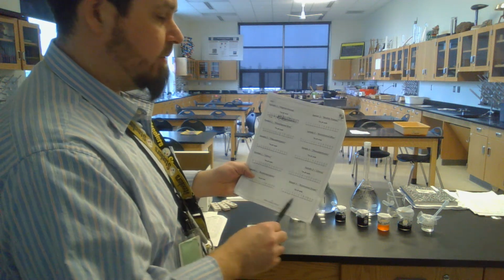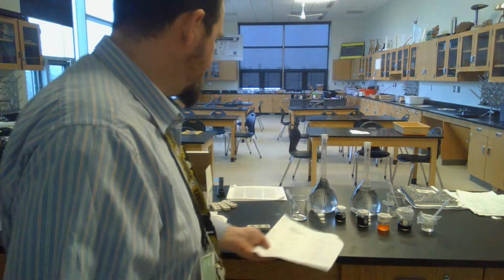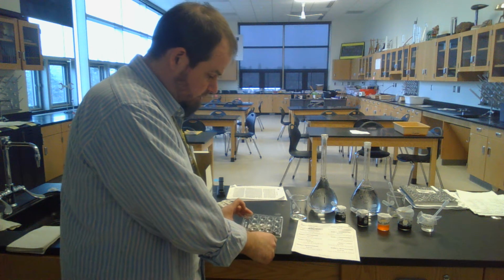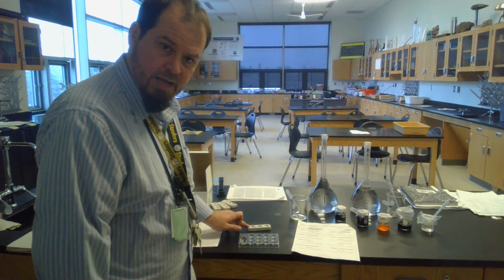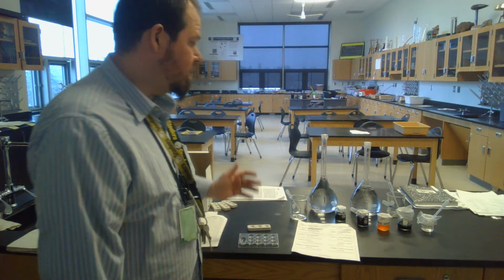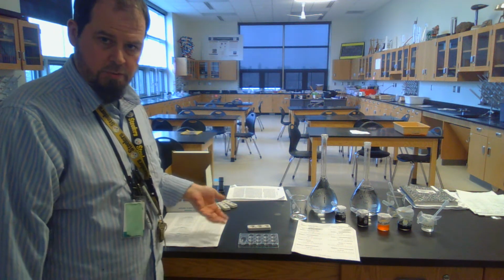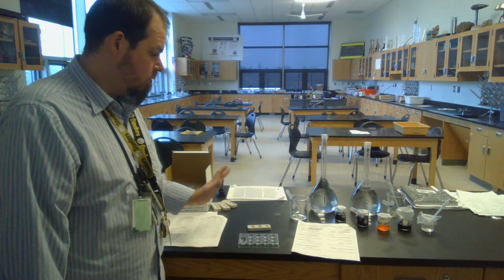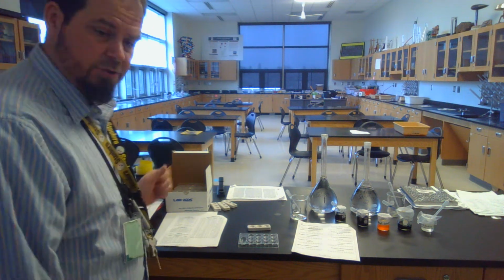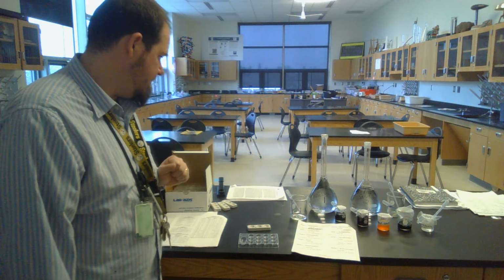The procedure for sample 2 is going to be exactly the same. You will have your ranges all pre-done. I would not rinse these because you have your 4 here. You can do 4 here and use the other side of the ceramic to do solution 2. I would just do all solution 1 first and get your data, and then all solution 2 and get your data before you rinse. And then they can go right in the drain and rinse thoroughly and leave to dry for the next group. And we can probably get 2 or 3 groups going at a time, maybe 4 tops.